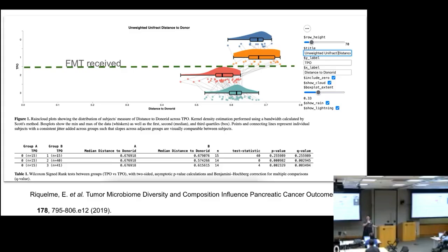I think that you have to look at multiple factors here. We could look at our distance to baseline and prove that they don't bounce towards their baseline, and that would be a proof of non-stability. Or we could look at alpha diversity and see how that trends over time. So I think this is more just a talking point, like, oh, maybe there's not stability, but not really proof of that.